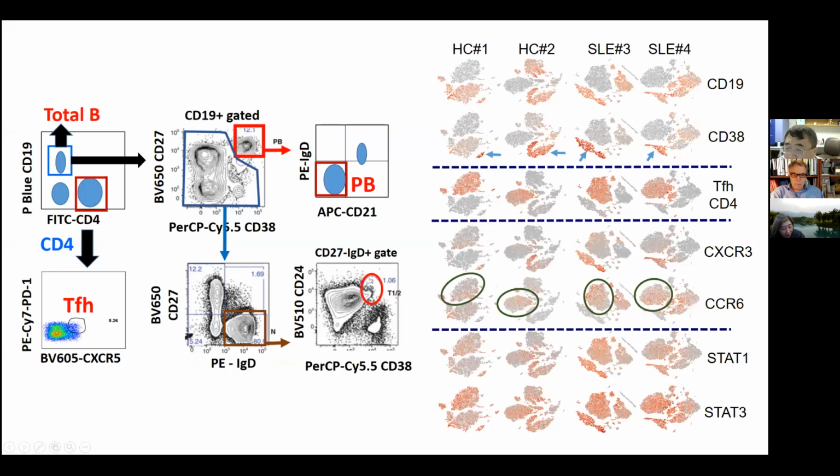Is that right, that you could see some IL-17 signature in the T cell? Luckily this is TFH. If you only do CD4, you may not see it too well, but now with TFH we might see better. You can see that these are B cell, and then this one is plasma in each sample. And then this is T cell in each individual.